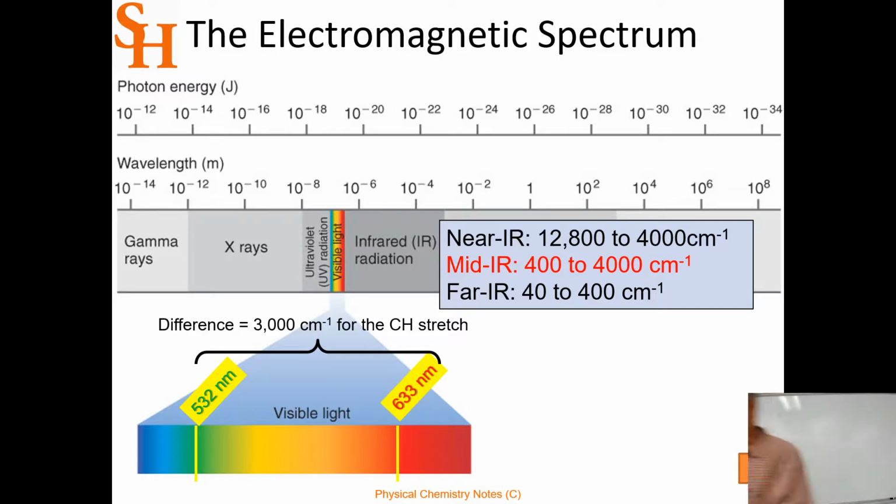Let me go ahead and do this on the board. So this is a very, very common laser system. So the garnet is the crystal structure.